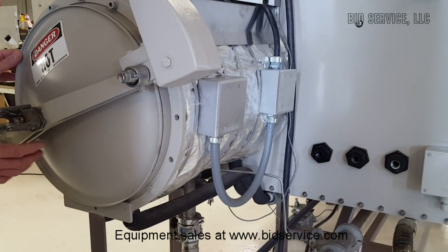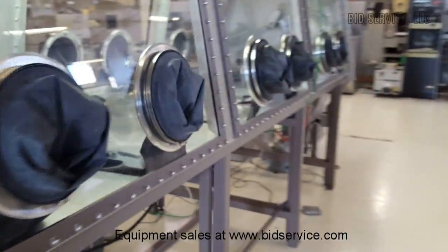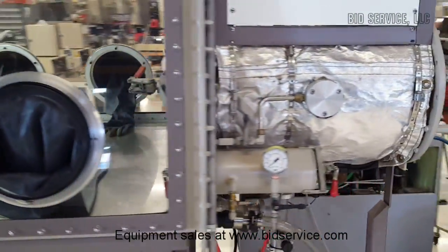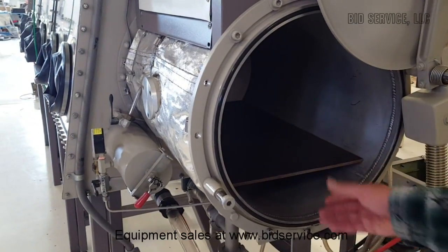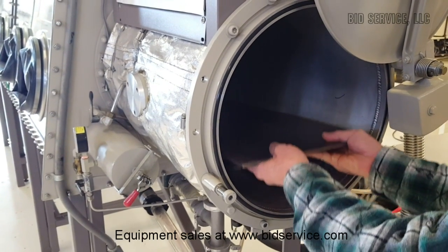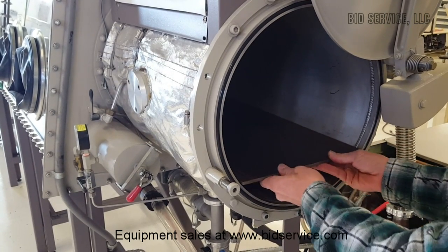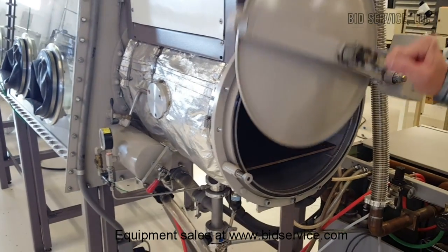I'll close this door and we'll walk around to the other side to talk about that antechamber. You can see this antechamber just has a plate there, and if you need to transfer in a large piece of equipment, you can remove that plate — it's a little heavy but it will come out. That's how we got the equipment in originally.